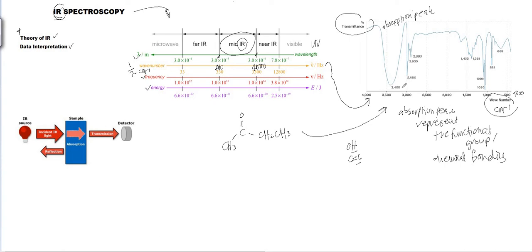Okay, so the way how do you collect all the data, which is you try to figure out, okay, what is important peaks that present in the spectrum, and then try to combine all the functional group involved. From that you can try to elucidate the structure lah. So this is how you are doing the IR.